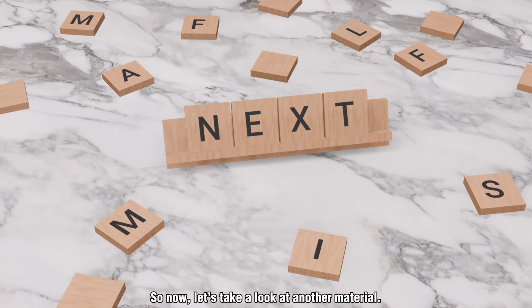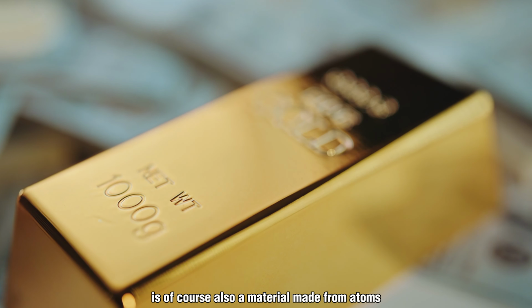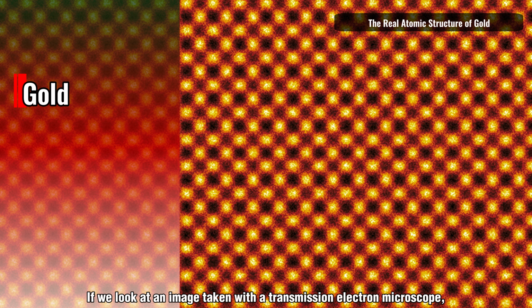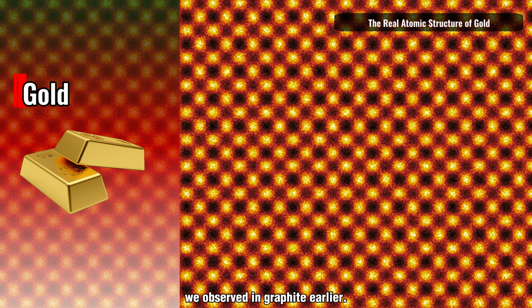So now, let's take a look at another material. This time, the material we'll examine is gold. Gold, which we are familiar with as a gemstone, is of course also a material made from atoms arranged in a regular pattern. So how does gold differ from graphite? If we look at an image taken with a transmission electron microscope, we can see an atomic arrangement that is quite different from the honeycomb structure we observed in graphite earlier.